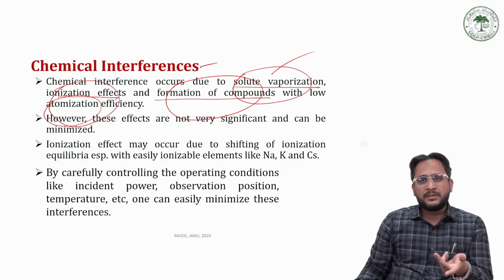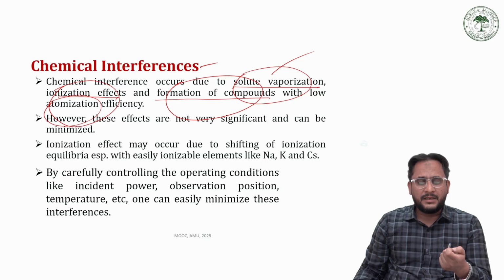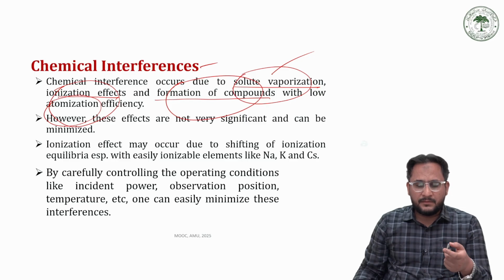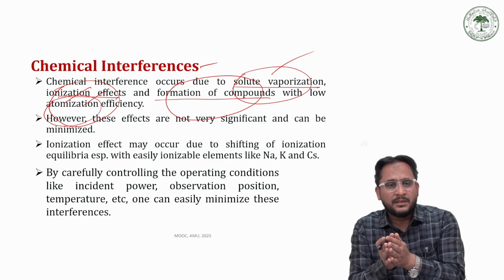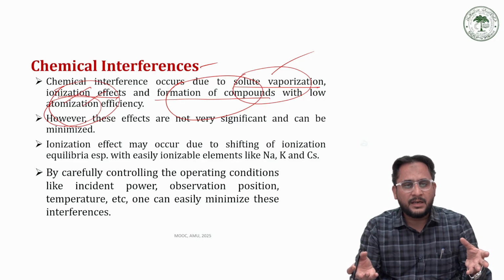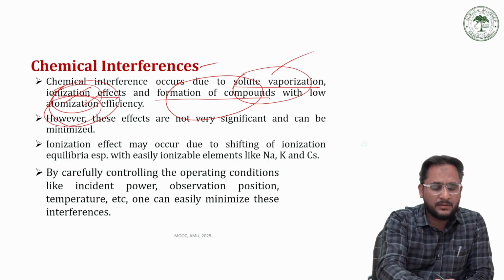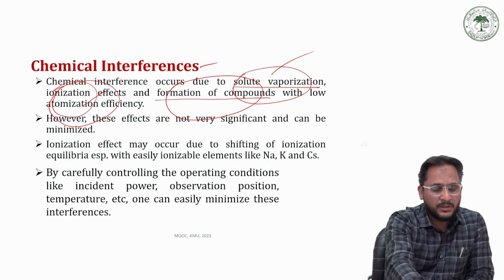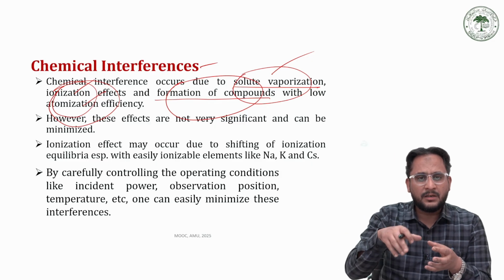Sometimes the sample does not ionize because of its thermal stability, or sometimes the sample ionizes very fast, so all the spectral lines are not being read properly.